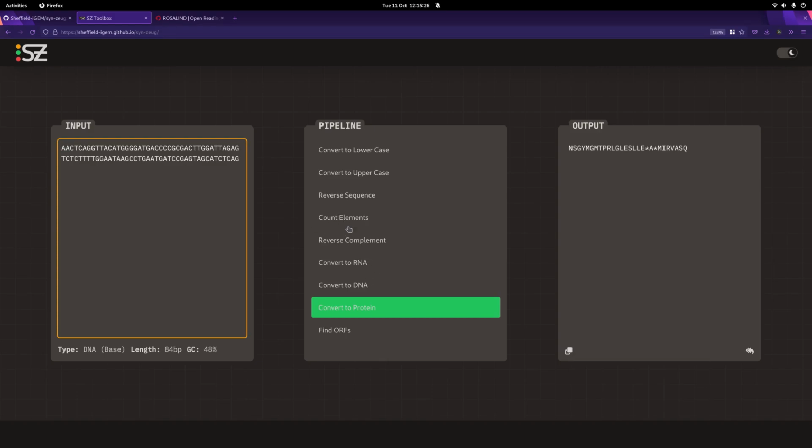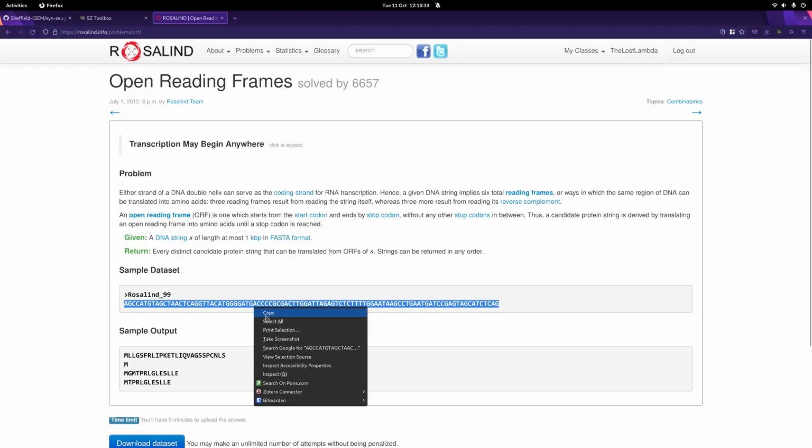Finally, I think, to show off one of our more complex examples, we'll just do a quick chain of actions coming from this source DNA strand here.